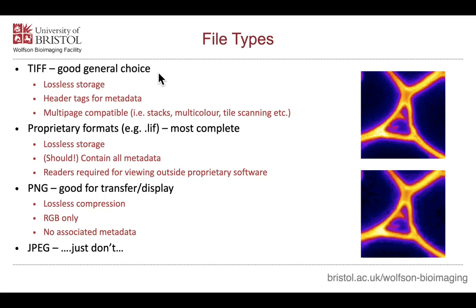They're also multi-page compatible, so stacks and multicolor tile scanning, etc. So you can have one file that encompasses your whole Z stack rather than having a whole series of individual files for Z plane 1, Z plane 2, Z plane 3, etc.